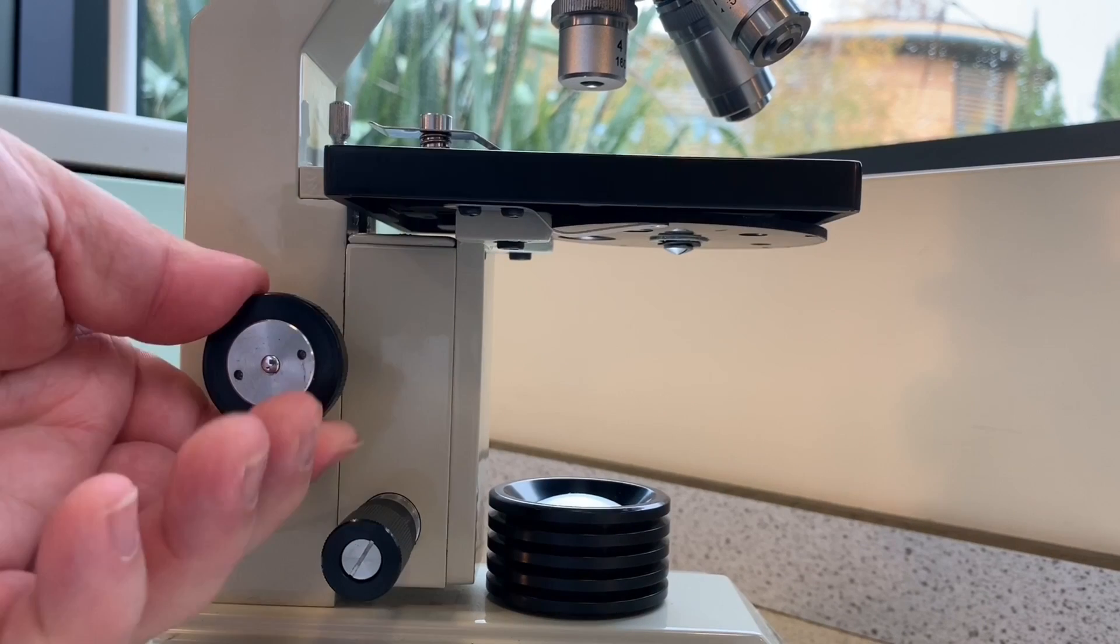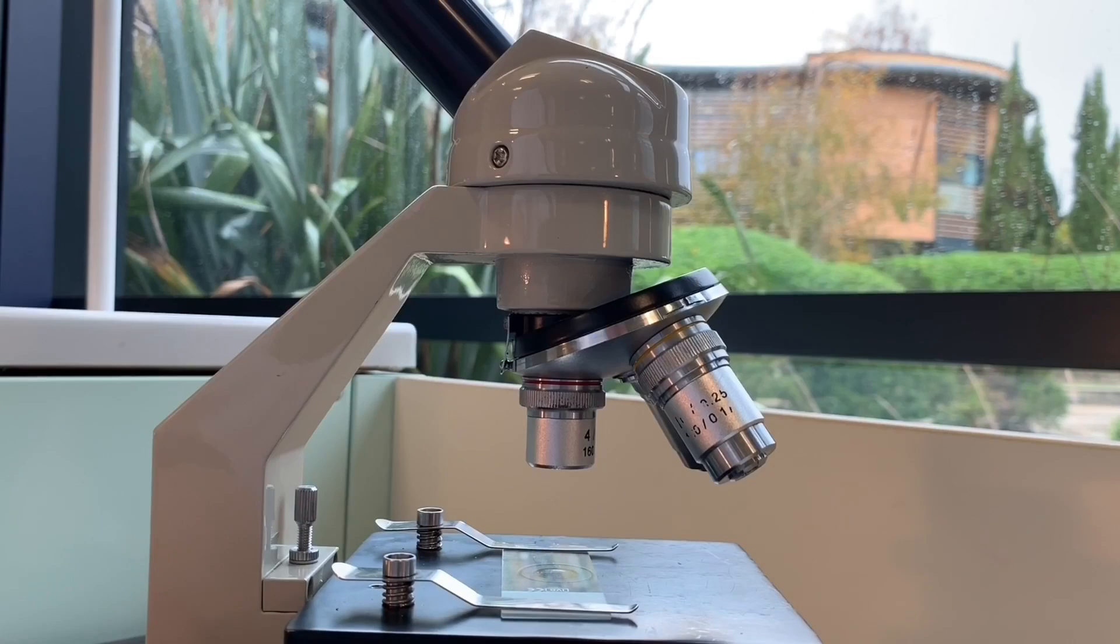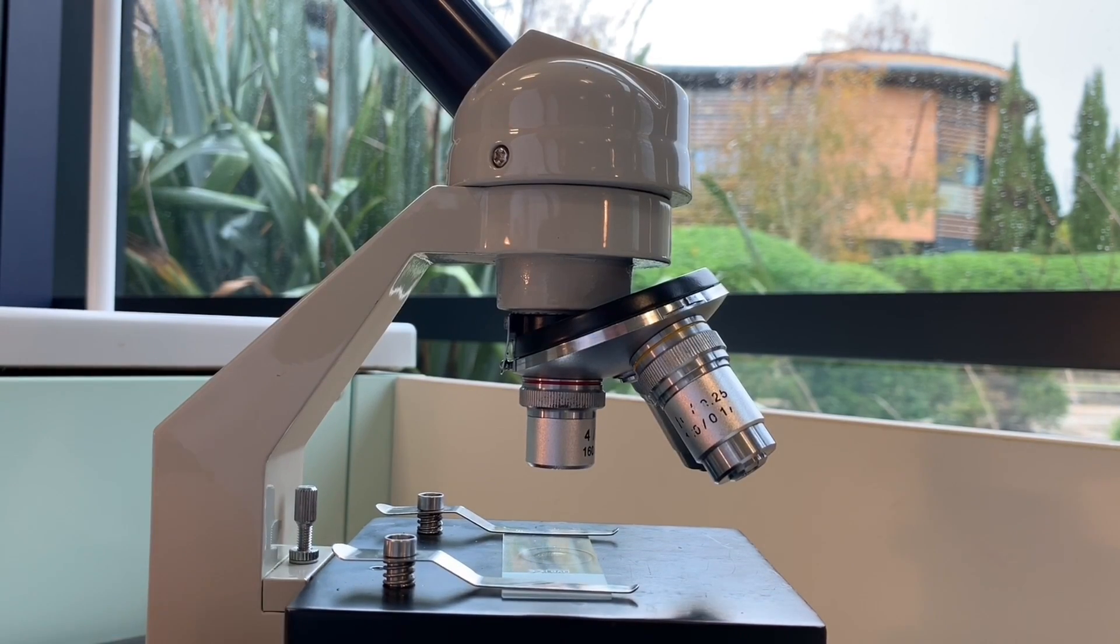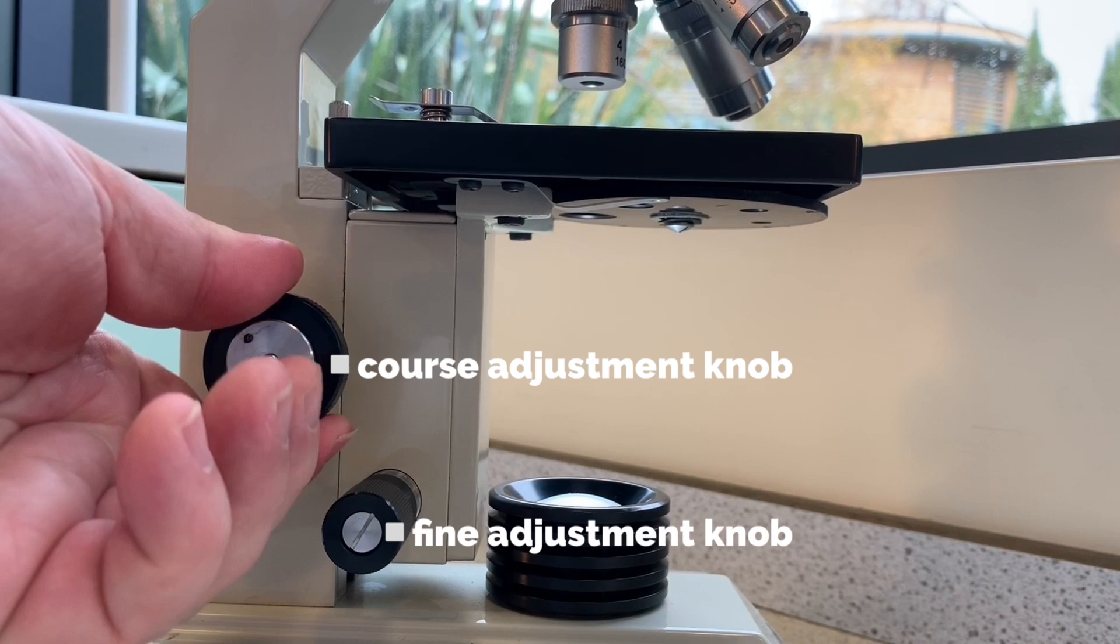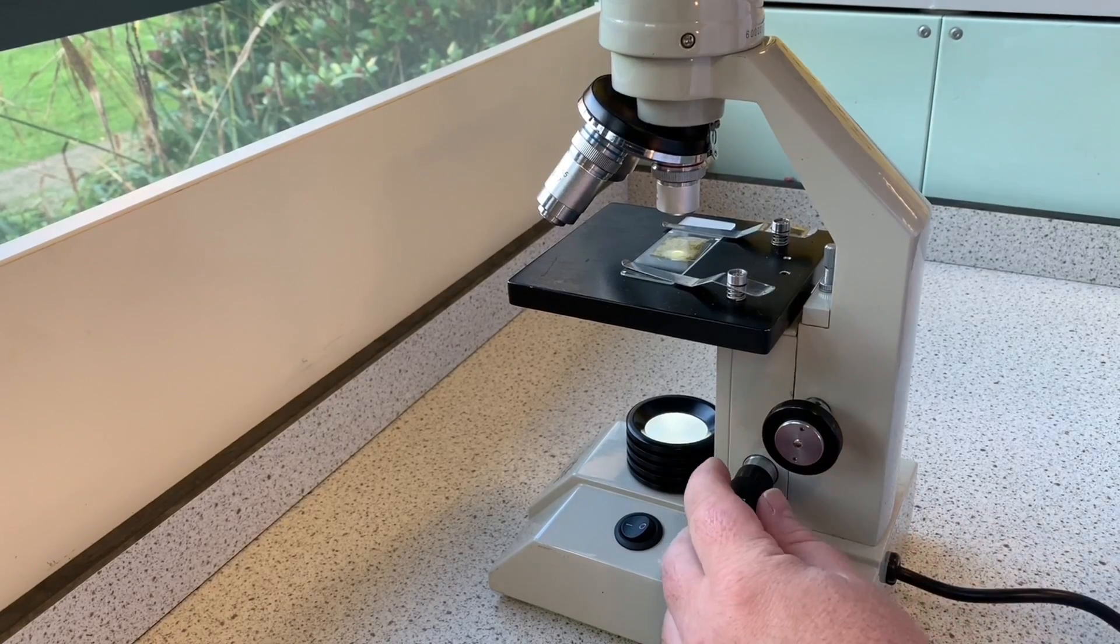The next part is the coarse adjustment knob. As you rotate this, it moves the stage and the specimen closer to the objective lens to bring it into focus. You also have a finer adjustment knob which makes smaller changes to the stage and helps to really get that fine detail from your specimen.